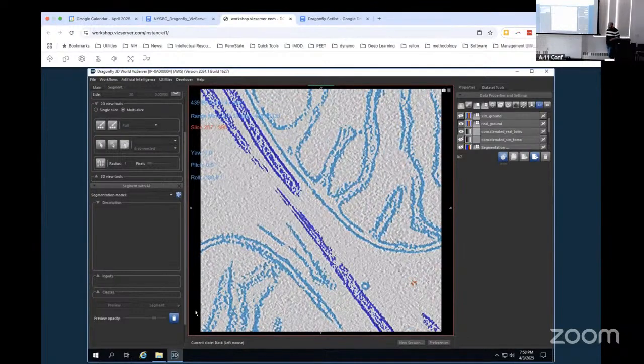And we did this in an iterative fashion. We started with just a small amount of real data from neurons and then moved towards including non-neuronal cells like bacteria and things like that.